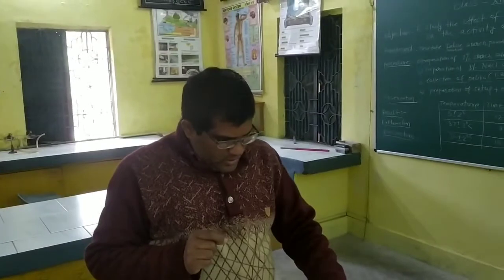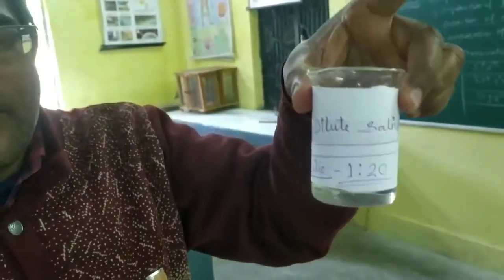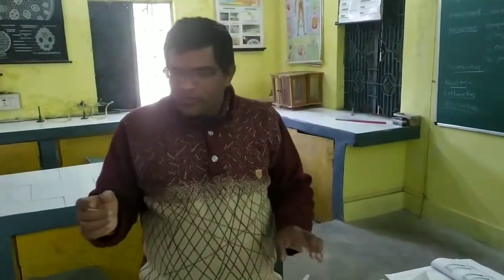Then the third requirement is saliva. Dilute saliva is a third very important requirement for the experiment. And for the saliva collection, what to do?